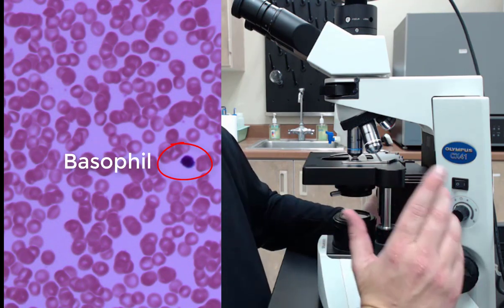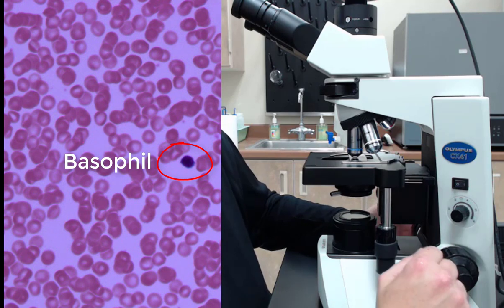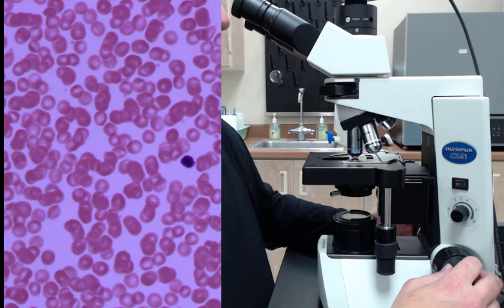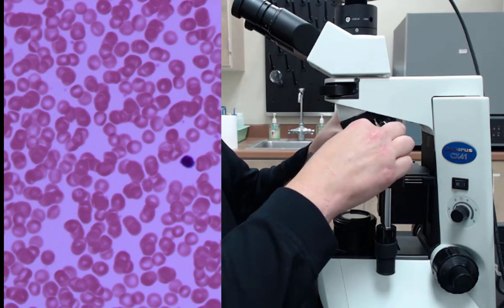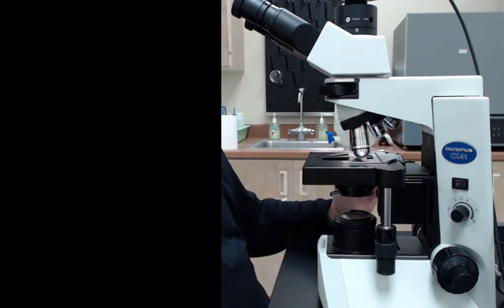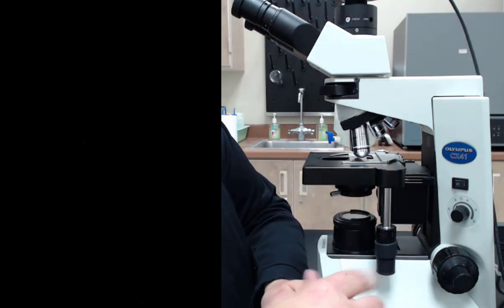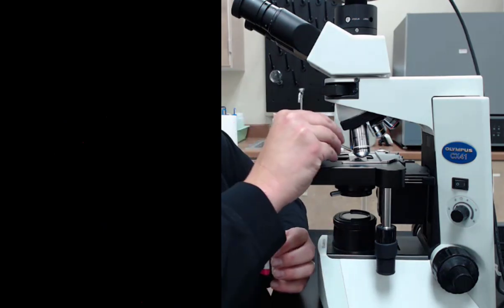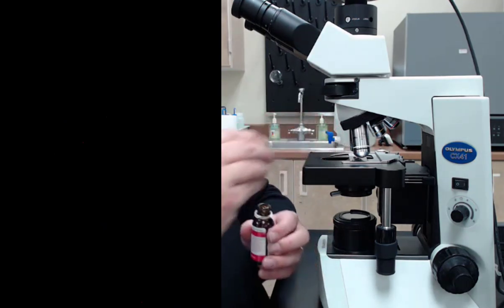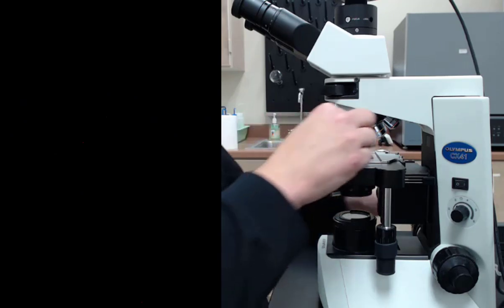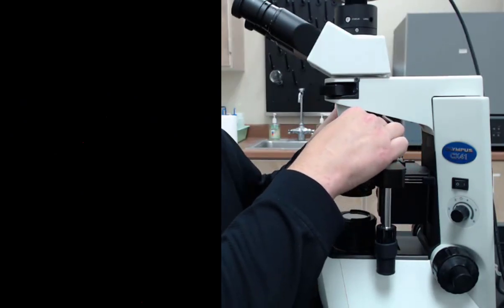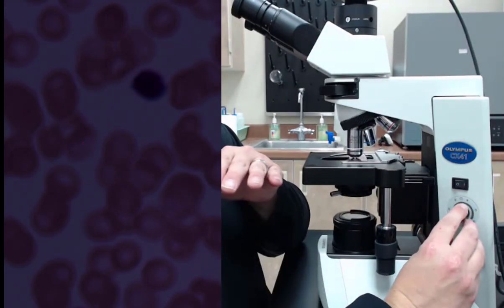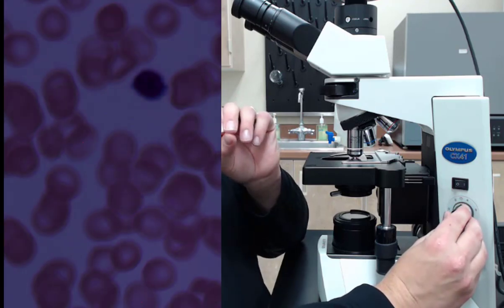So I've done other videos on oil immersion. I've done other videos on why we need oil for oil immersion. But now let's just go ahead and do it. So the key here with oil immersion is we have to put immersion oil right on the slide. So I'm going to turn this half a turn. So it's going to immersion oil. Immersion oil works because it has the same refractive index as glass. So I'm going to put a single drop of immersion oil right there on the slide. And then I'm going to slowly move the objective into place. And what should actually happen is the glass with the immersion oil on it should now be touching the oil immersion objective.